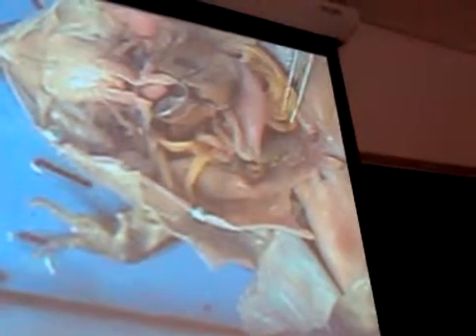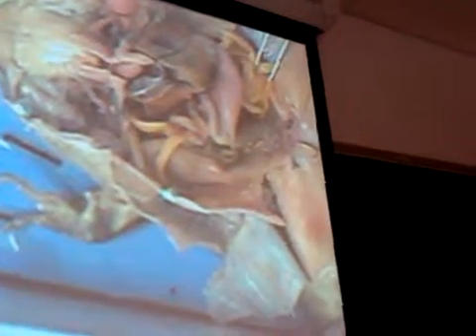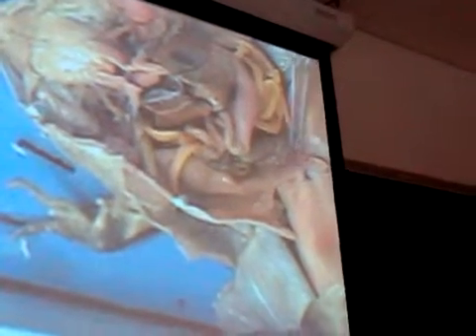These finger-like projections, fat bodies, right? So you would imagine a frog in the north going into hibernation would be loaded with fat bodies. So fat reserves called fat bodies. Are we all right with that? So what are yellow? Yep, these little finger-like projections, right? Fat bodies. And there's some more fat bodies there.